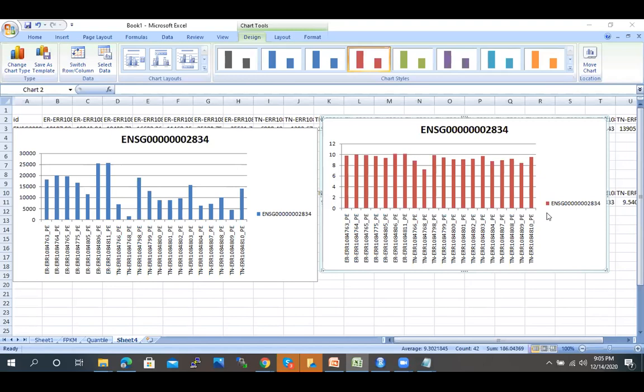So this shows why normalization of RNA-seq and RNA expression data is vital to derive any biological interpretation, especially correct biological interpretation. This is how we can perform log scale transformation and quantile normalization using the T-Bioinfo server. Once you have data that has FPKM values, a gene expression table, you can compare that.